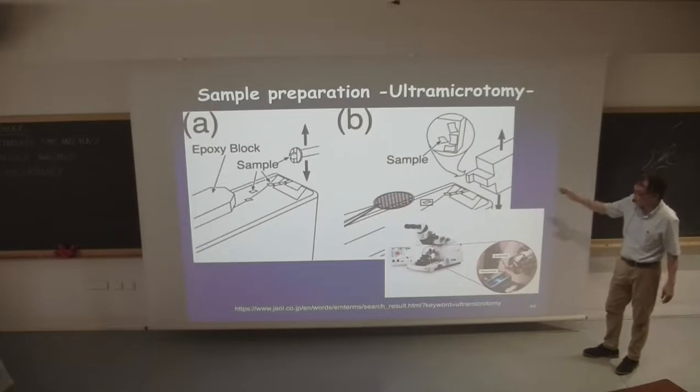So for a sample like polystyrene, which is very solid, you can do that at room temperature. For rubber or maybe hydrogel, if you cool down the hydrogel, then the water inside the hydrogel crystallizes, isn't it? And then it may destroy the structure. Could be. So you need to be a bit careful about this crystallization of the water.